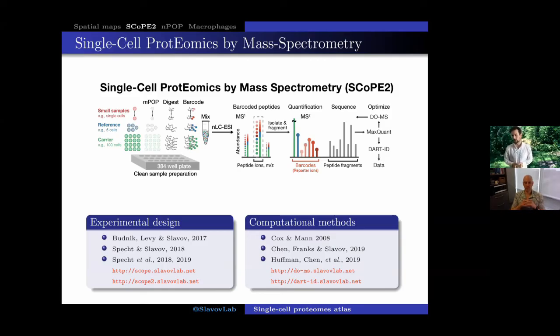And then we've used additional algorithms to help us enhance interpretation of the data. For example, we like to use retention time information to enhance confident peptide sequence assignment. We were very concerned about using matching approaches, matching ions, that did not estimate false discovery rates. So we aimed to develop a rigorous Bayesian framework that would estimate the probability of wrong sequence assignments.